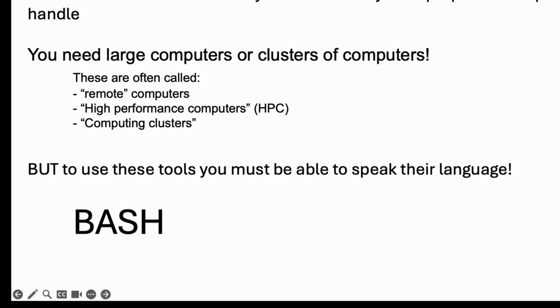And so today we're going to start playing around with some genomics files using some simple Bash commands to get started. And I think that probably most of you are not biologists, but Bash is just a very widely used tool. And if you have any kind of big data problems in your field, I think that this can be really helpful for you as your way to start to access high performance computing resources.